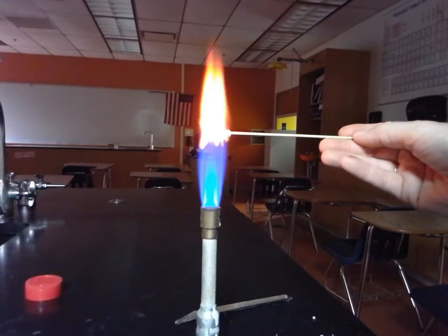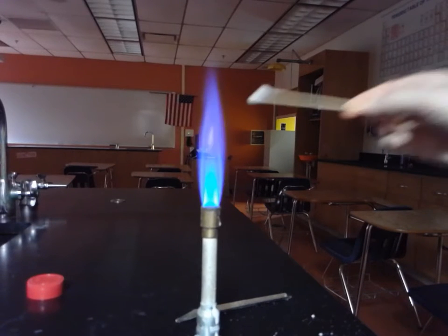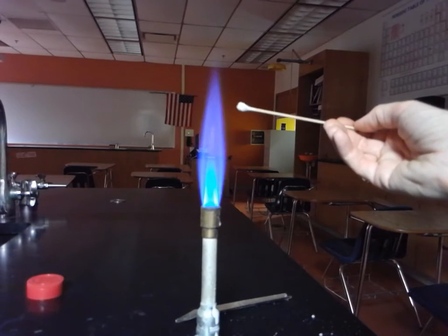Well, this is not potassium. That is definitely strontium. I got this mixed up. Where's my potassium? Let me try this one. Hold on, children. Give me a second. Always label your containers. Alright, there we go. This one is potassium.